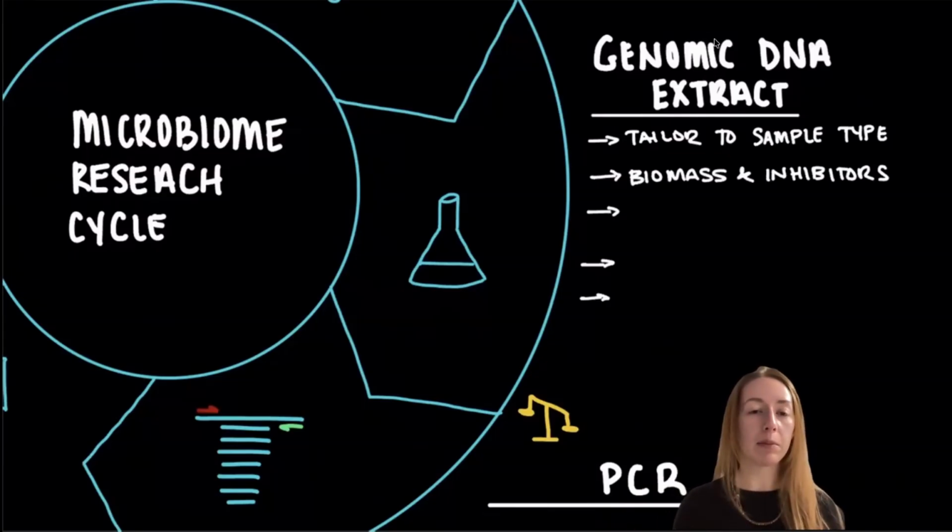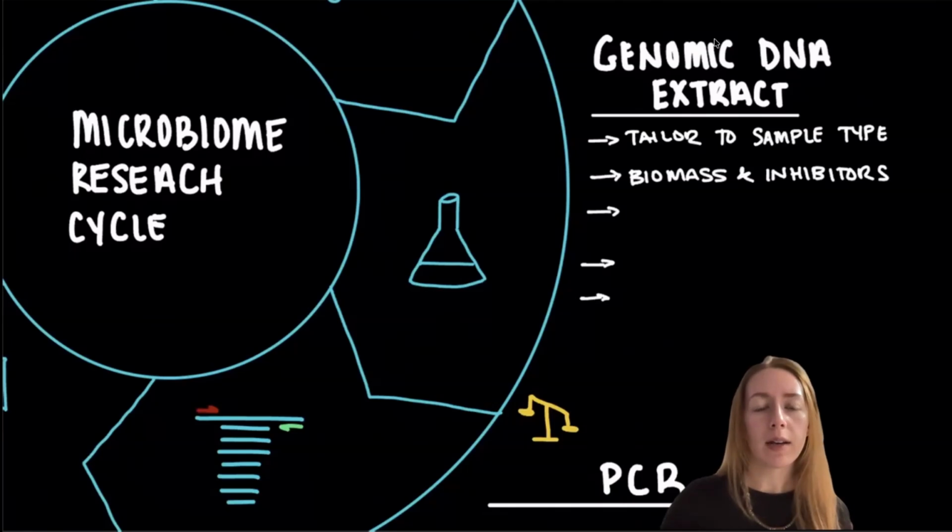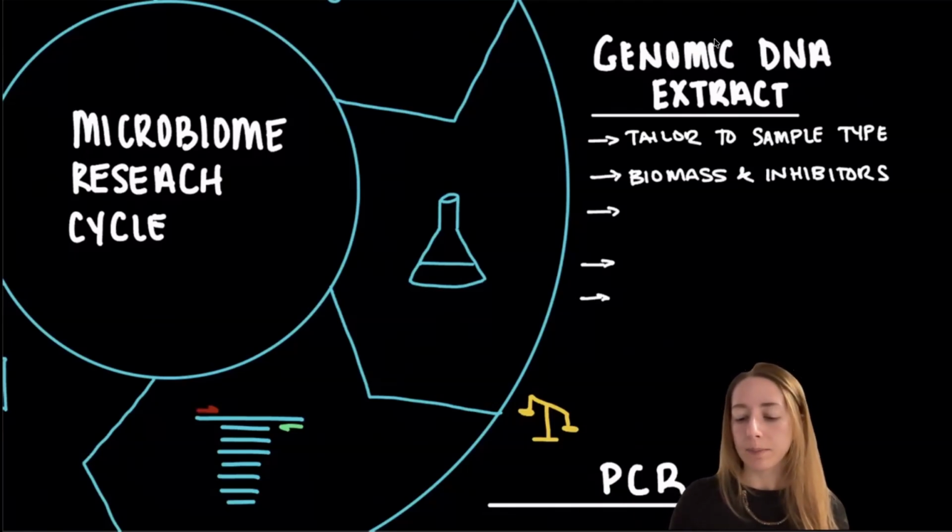There are kits that are able to handle these situations better. Low biomass you might find sometimes in plaque samples, or they're really hard to extract, or in a situation I've been in where I had environmental samples from the Arctic that had very, very little microbes in it. So those are things to keep in mind, but stool, for example, will have extremely high biomass.